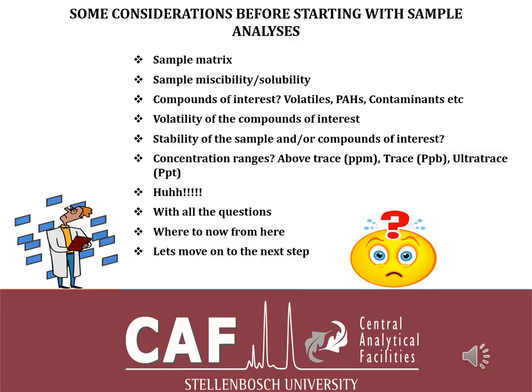Also, the injection mode you can use is splitless injection, but when you're doing the ppm range, splitless might be too high. You will definitely have to use a split injection. We'll also explain the difference between split and splitless, and there's an example of how to calculate a split ratio, how much of the injection you're making.